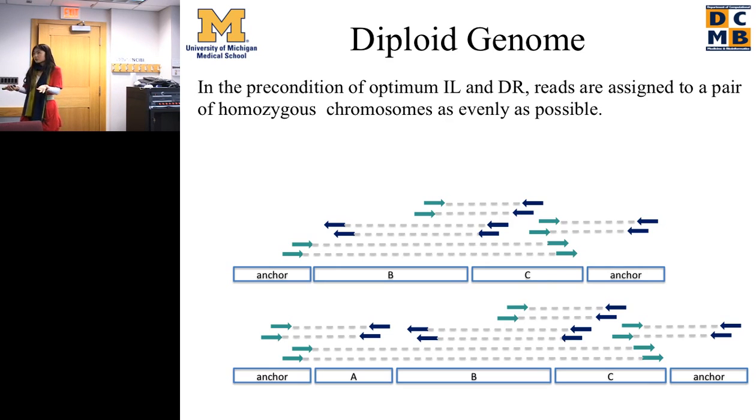But if the region is really too messy, with 10 or 20 different breakpoints, we will maybe set a larger number of iterations. So this would not necessarily be a great tool for mapping something like the Prader-Willi-Angelman region, which is incredibly complex. Even in the reference sequence, there are a lot of nested and overlapping duplications and rearrangements within that region. I still think it works well.